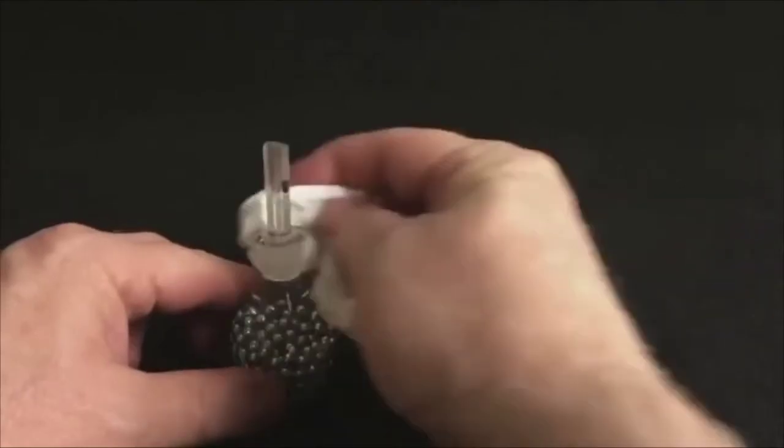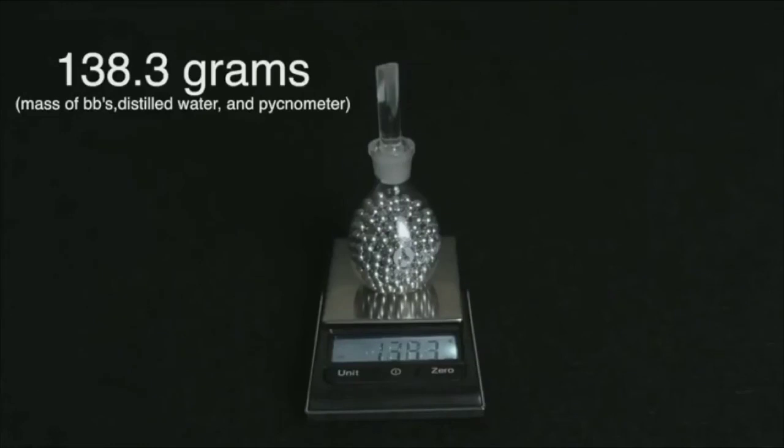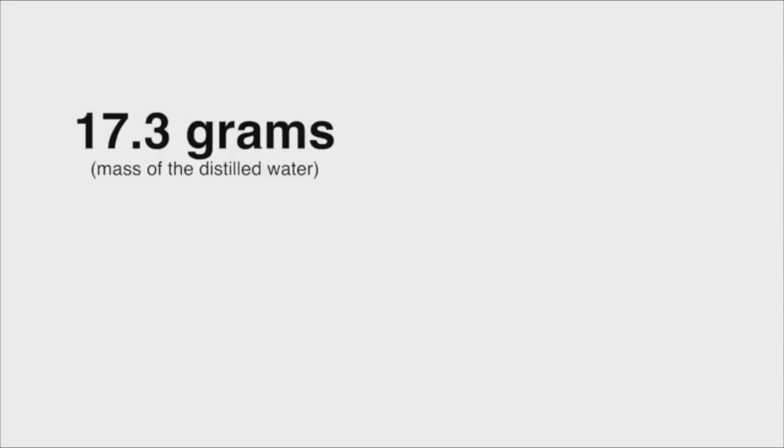The pycnometer that is widely used in sugar factories is the book model pycnometer, which has a double wall and is equipped with a vacuum to be able to hold the temperature of the contents of the pycnometer for a long time, so that during determination, the temperature of the solution can be held constant.